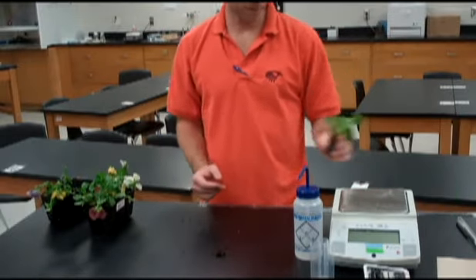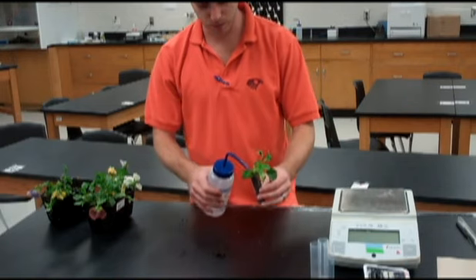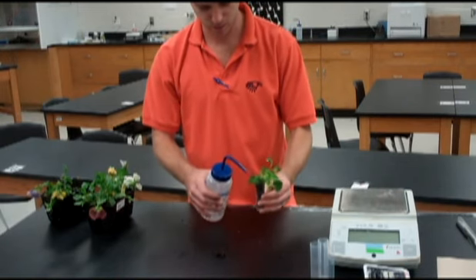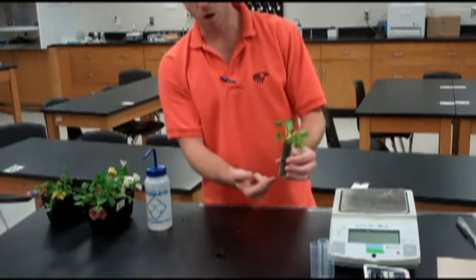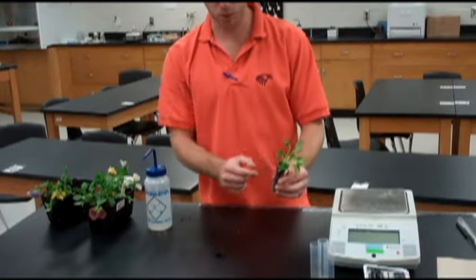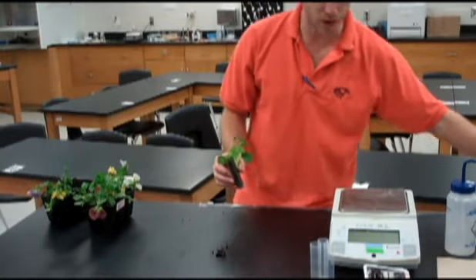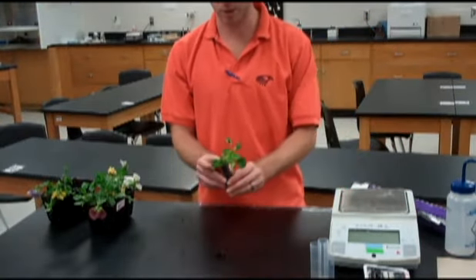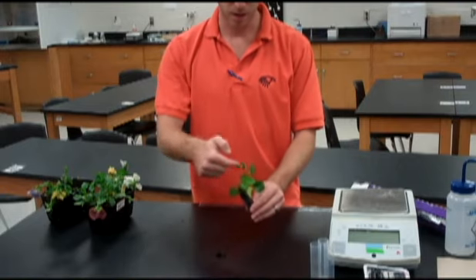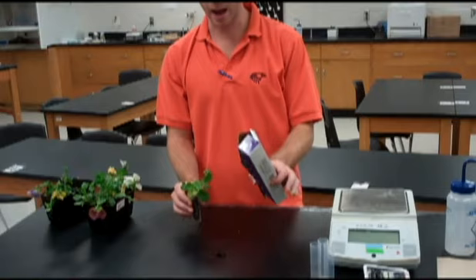Once you've got that done, we need to water the plant just a little bit to make sure the dirt is all nice and wet. We don't want any standing water at the bottom of the tube, just some moist dirt. Then, depending on what your tubes look like, you may want to cover the top to prevent any evaporation. That way the only water coming out is water coming through the plant itself.